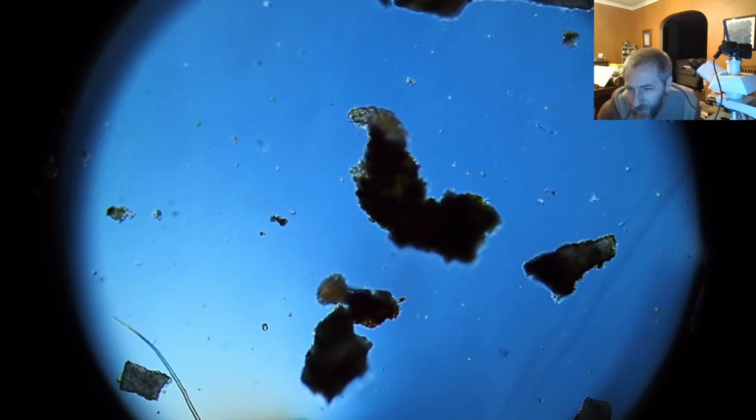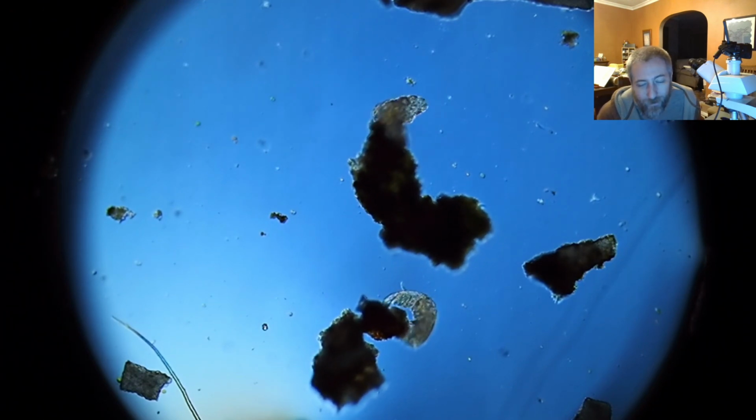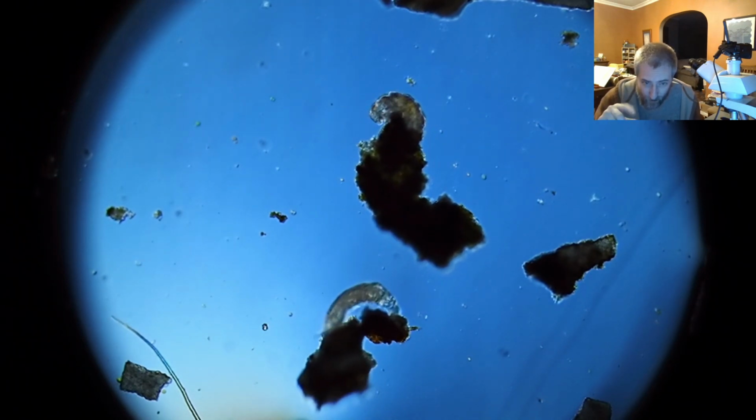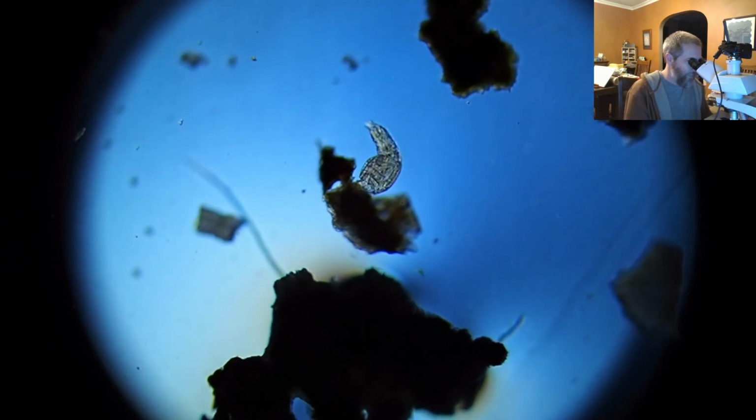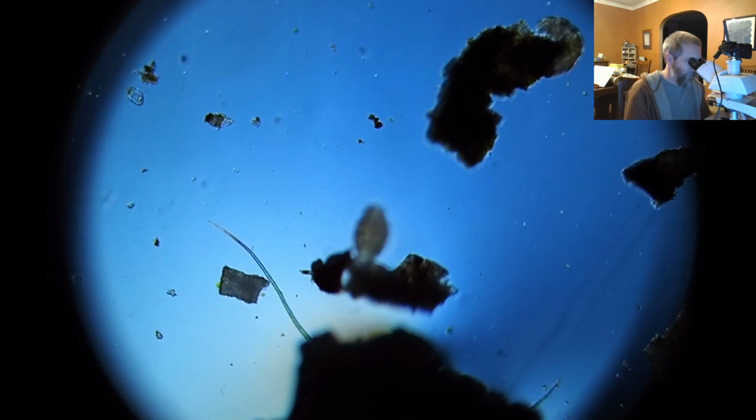Does that thing have a foot and a finger? That's what it looks like to you. So if you mean the thing at the bottom, the rotifer has a foot with a little 3-pronged or 2-pronged claw on the end of it. Let me see if I can get a good image of it. And then it's got like just a column-shaped body that it's sort of rising in and out of. And then at the top, a sort of little antenna.